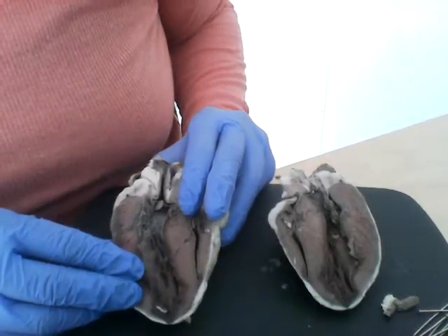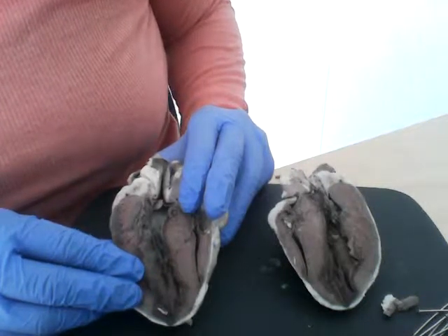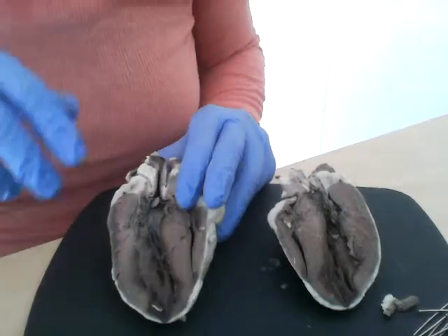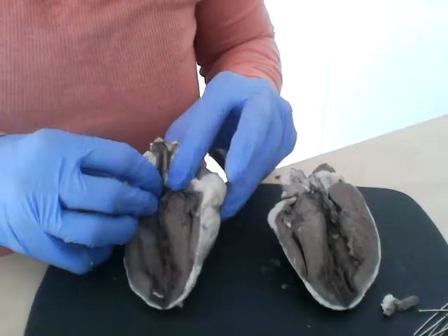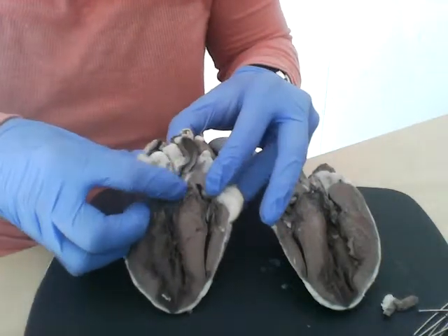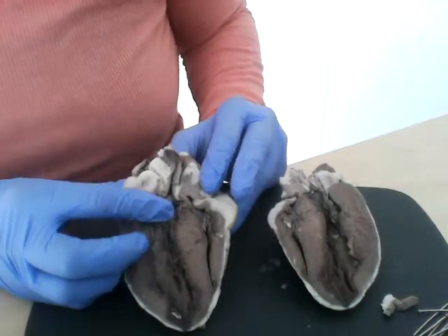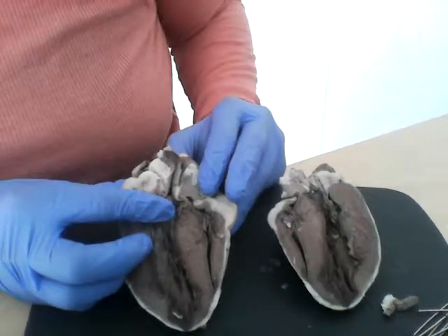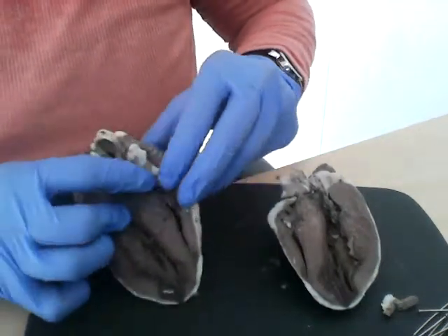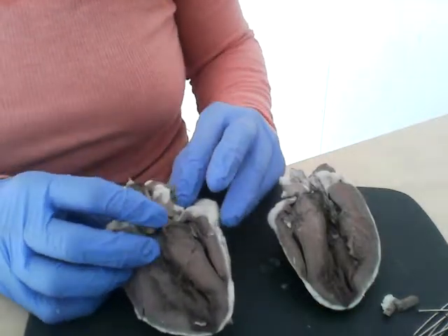The pulmonary valve. So let's see if I can find the pulmonary valve on this little guy. Coming from here down, the pulmonary valve there. And then the aortic valve. And let's see if I can find the aortic. Oh, this is the aortic valve. This is the pulmonary valve. And that's it.